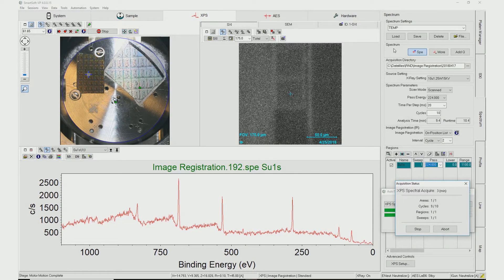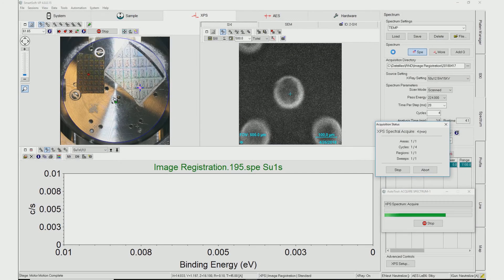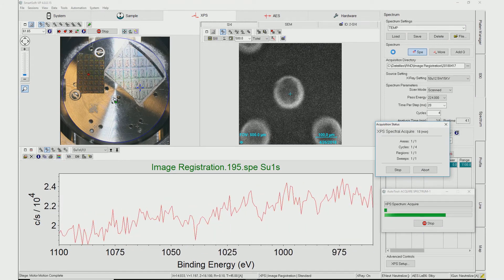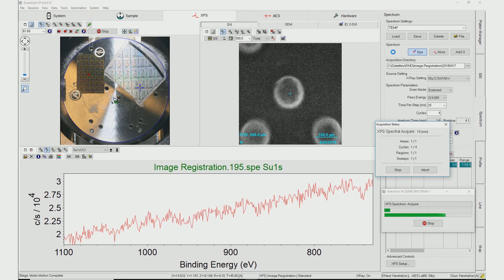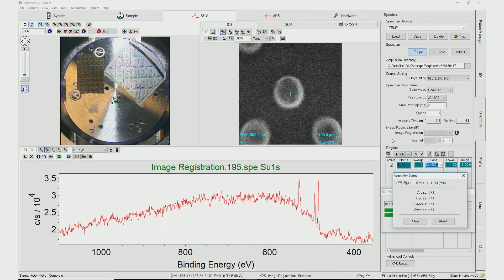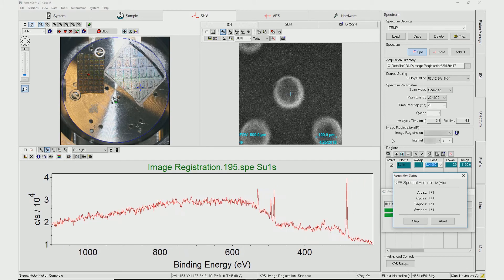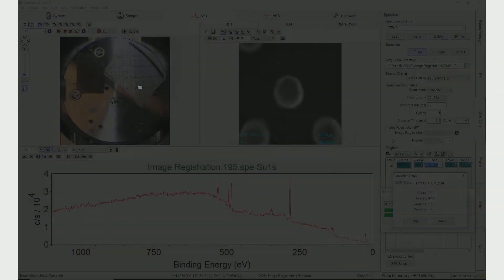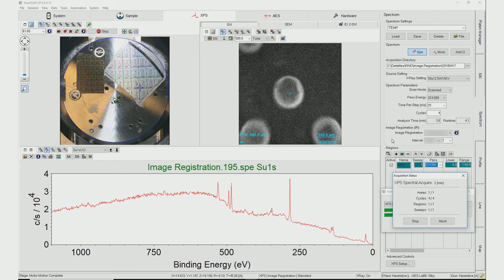When the acquisition of the first point is complete, the stage moves to the next queued position. In this case, the analyst has deemed the 150 micron solder ball large enough that Image Registration is not needed. With the Image Registration software, turning the routine on and off at specific positions can be easily done. The Image Registration button has been turned off for this second point in the analysis queue, and spectral acquisition proceeds to completion without Image Registration before moving to the next location.